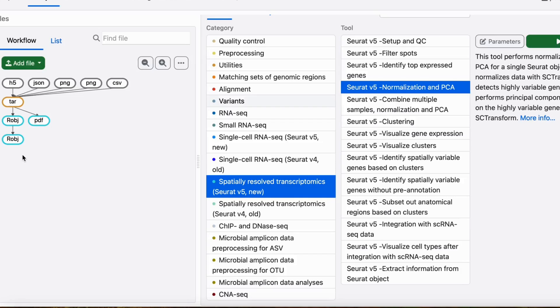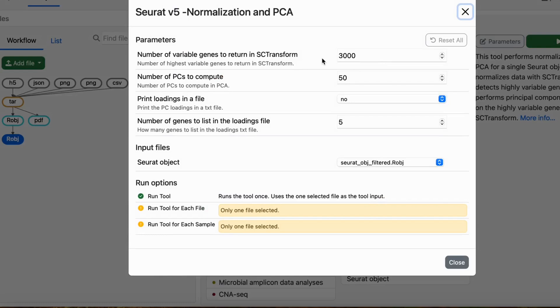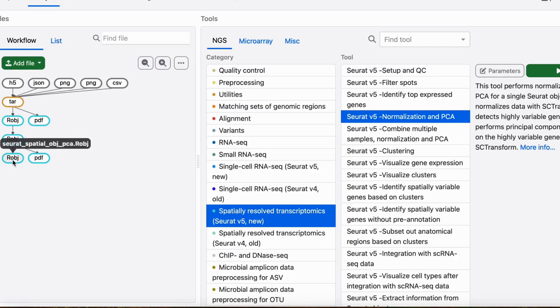We can select the Seurat object after the filtering step and select the values for the parameters. We can choose the number of variable genes to return in SCTransform, and the number of computed PC components. We can also choose whether we want to print the PC loadings in a text file. After running the tool, it outputs a Seurat object, PCA plots, and optionally the PC loadings text file. The PCA plots can be helpful in selecting the number of PCs for the next clustering step.